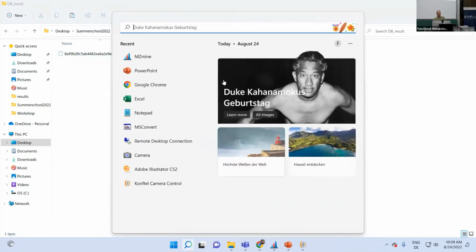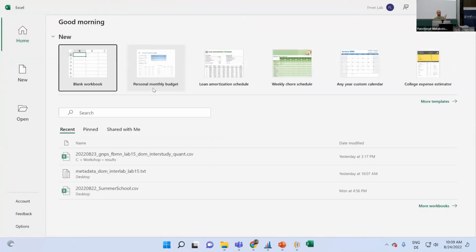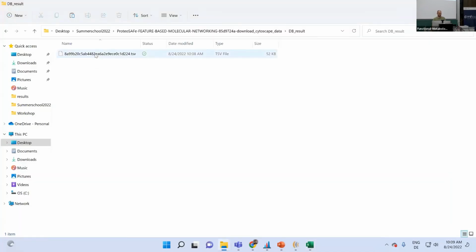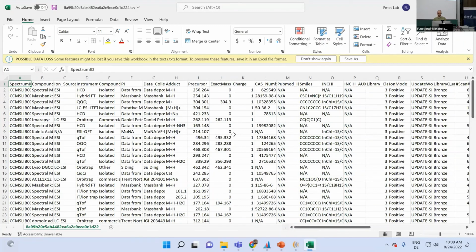This is a TSV file. So I can actually drag and drop this into Excel, or if you have Open Office, into your spreadsheet tool there. Let's see if that works. So I just drag and drop it in here, and now I get the full information. And to unlock all the info, that is how I would work with it.